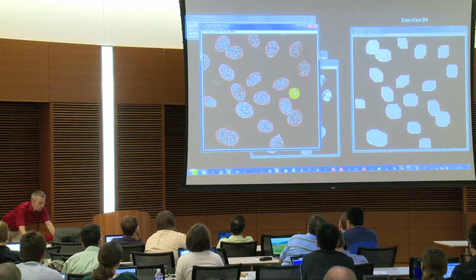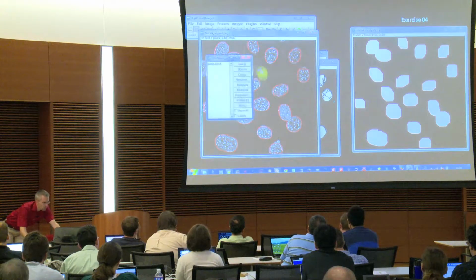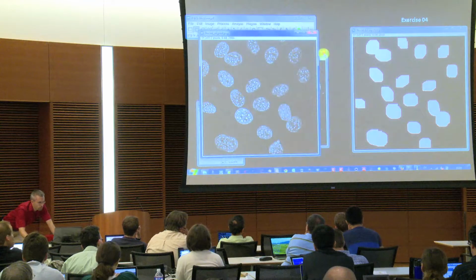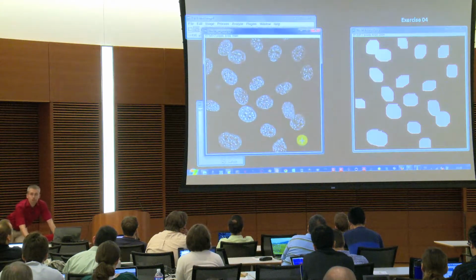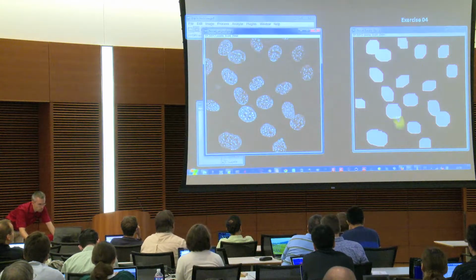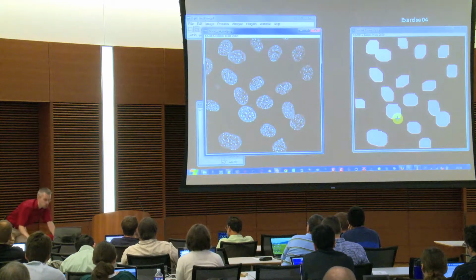So what is the alternative? I will save this here in the ROI manager so that later on we can compare that. The alternative would be, so transferring a selection is Shift E. It actually gets the last selection back, but if you're in a different image, you transfer that.